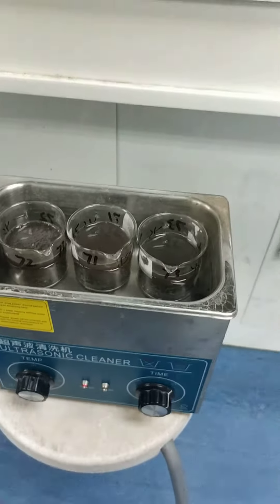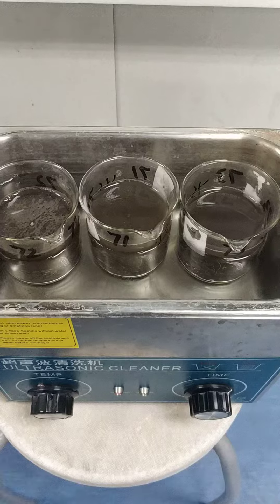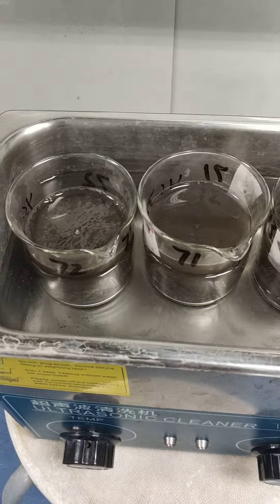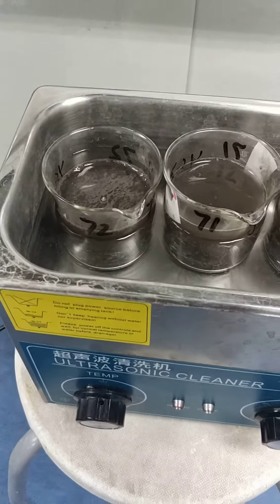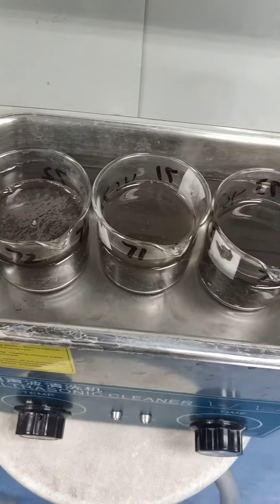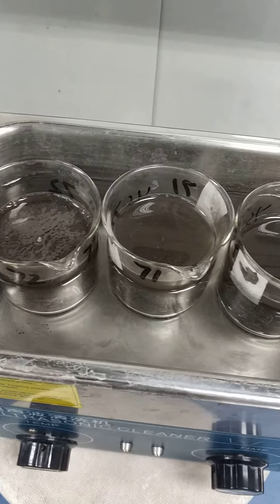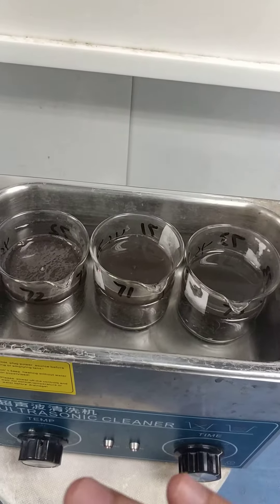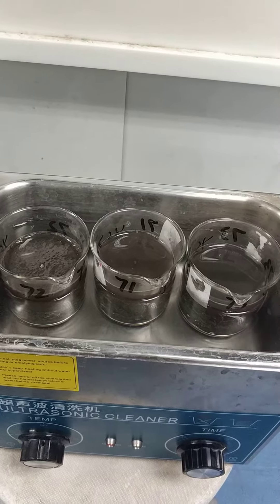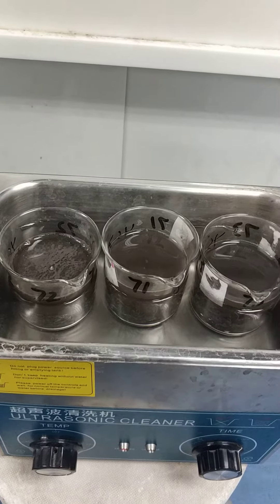After three minutes, you can remove the water. These are the three beakers of samples. You can put the water at the level so the writing of your sample number cannot be removed by water — the beaker should be at the half level of the water so the writing cannot be removed.